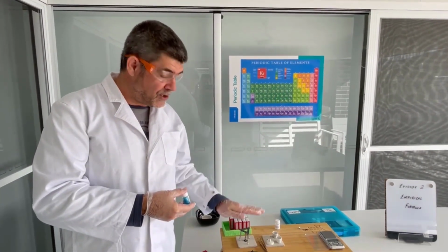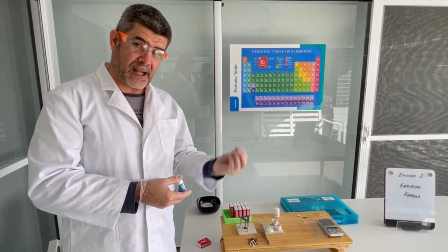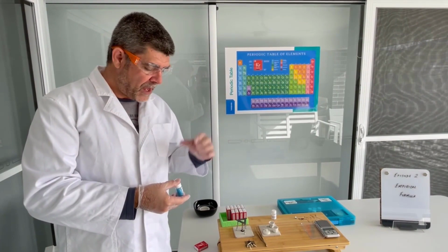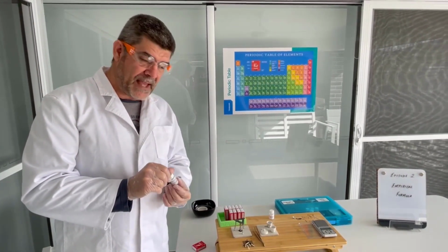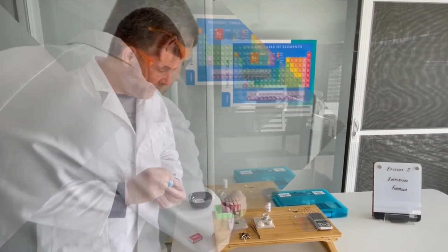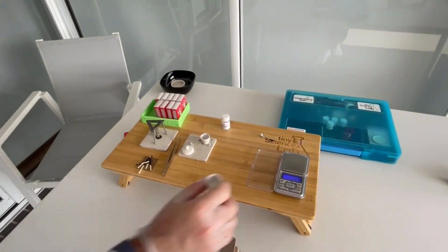So this time, I don't want to put the crucible lid on, I want to leave it off, and hopefully some of that water will escape as steam or water vapor, and we'll find a different mass for this once we've driven all the water off. So we're going to use a second crucible. This one's nice and cold, so I can handle this one.